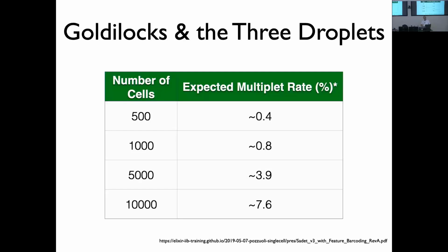Should be able to, I'm trying to think if you can. I know percentage of mitochondrial genes is used for QC. Usually the percentage mitochondria is used. I think that Cell Ranger, does it filter on that? No, I guess not. Ask Tyler next week, because this is something we've been through. I think that what he normally does is do the mitochondrial filtering downstream, and I can't remember if Cell Ranger does anything, but the multiplet filtering is a somewhat similar approach. I can talk a little bit about it.